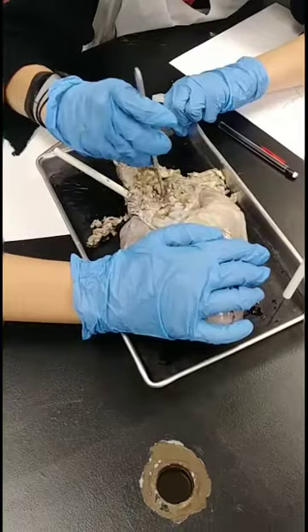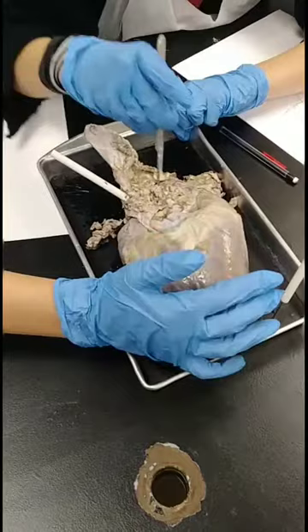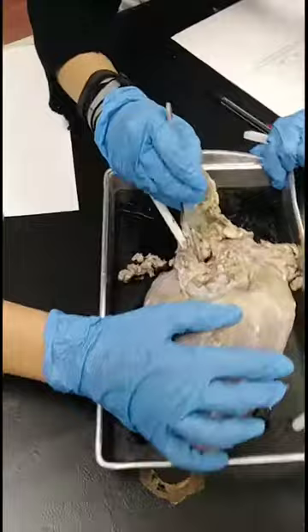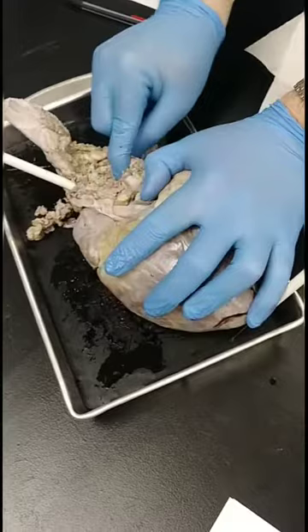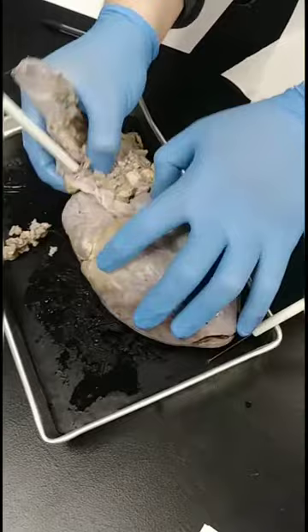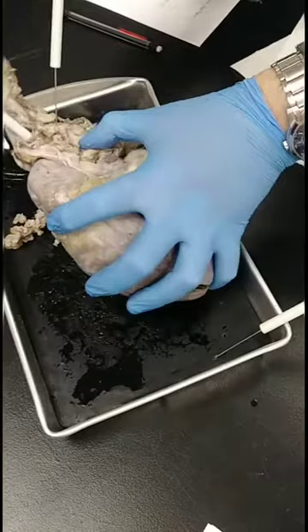Take a look at this. Compare that thickness to this big one. I can see it through this. Yeah. Okay. A metal pin. Do some of the gunk off? Okay. Oh, look at that. Good. So you exposed something else down here. They gave you a lot more of the pulmonary trunk. Last year, this was mostly cut off, so I'm glad they have more for you guys to look at this year. Let's take one of your probes.